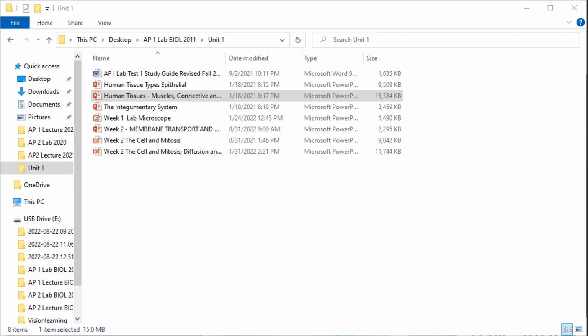The saltwater cell weighed 33.8 grams, and now it weighs 37 grams. So that one worked very nicely.